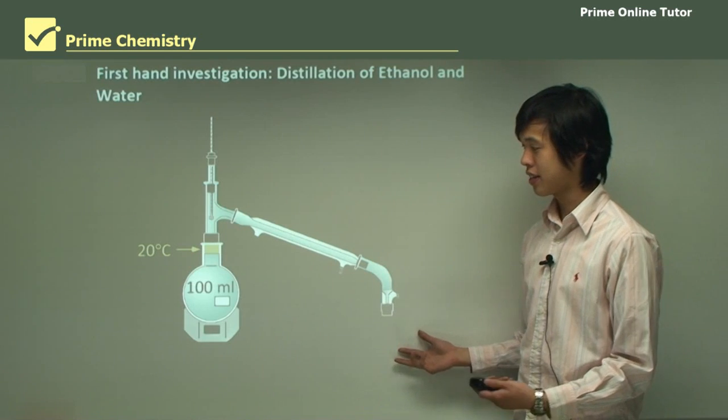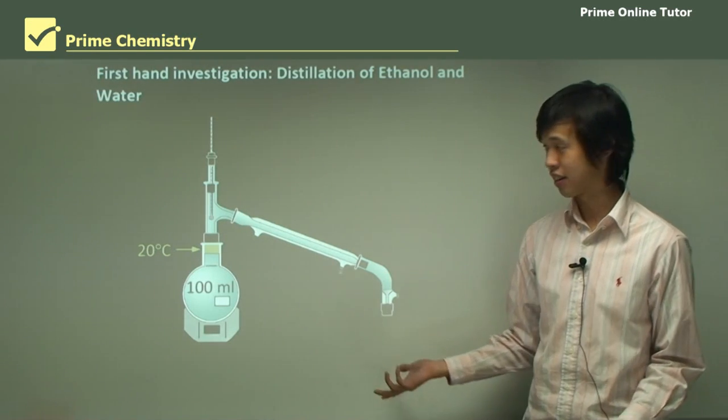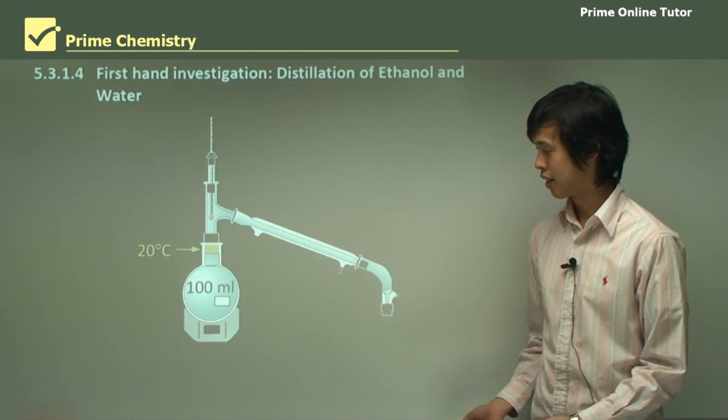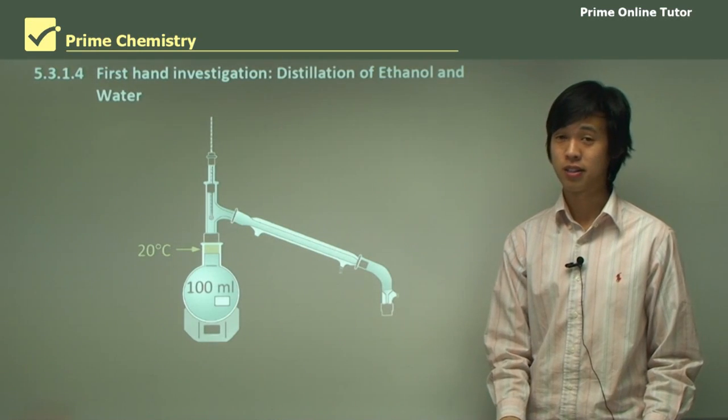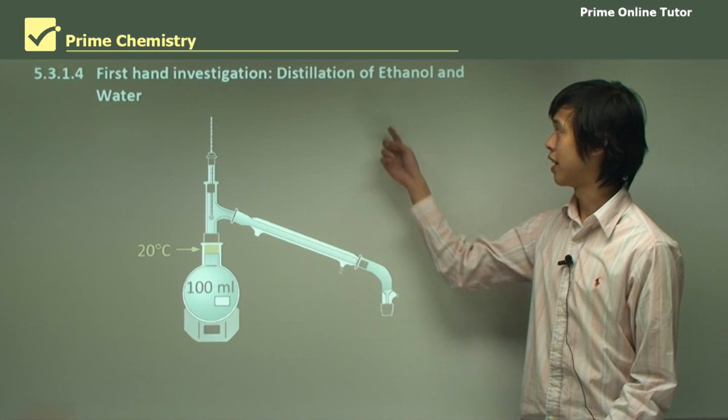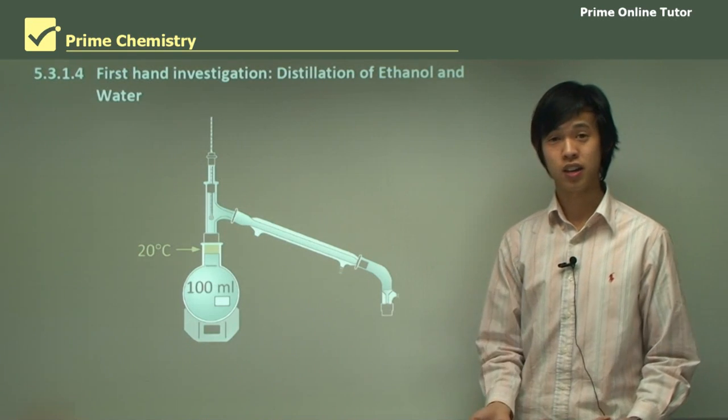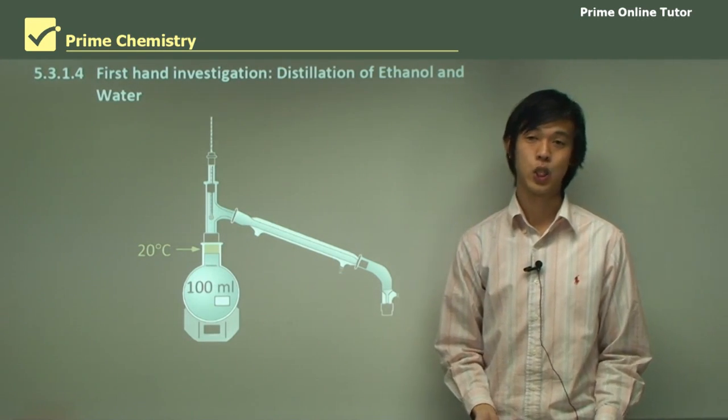So this is our standard apparatus, a distillation apparatus. And so we'll explain what each part is and how we're going to use it to separate ethanol and water, because that's quite an important process, even in industry.